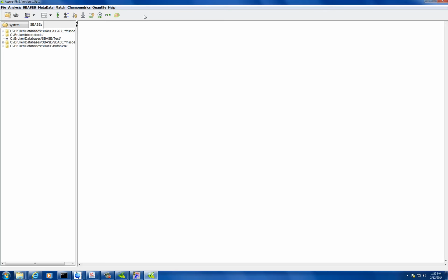Like you guys do a certain part, and then someone else takes over, and then we'll go from there. Okay, we'll switch seats. Guiding. So everyone, by the end of today, will play on this instrument. And there's really no way to break it.